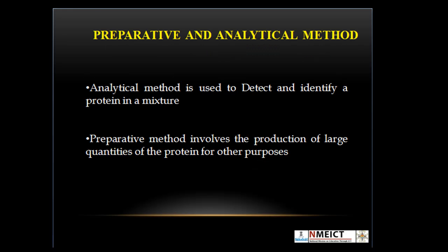Preparative and analytical methods. There are two types of protein purification methods. Generally, analytical methods are used to detect and identify a protein in a mixture, while preparative methods involve the production of large quantities of the protein for other purposes.